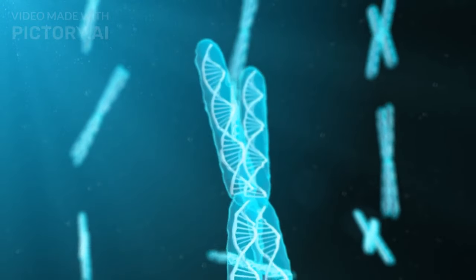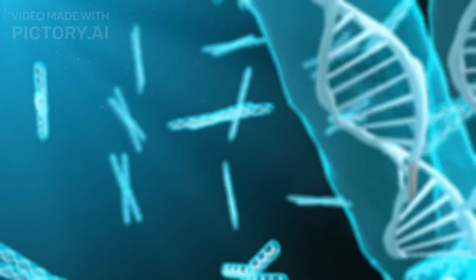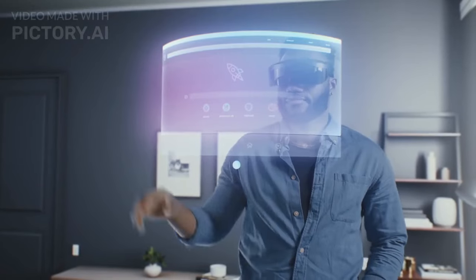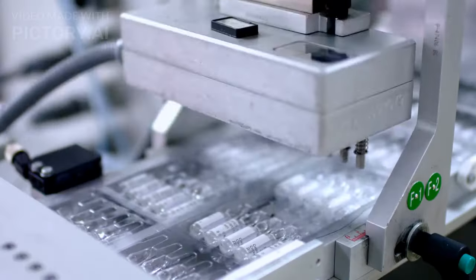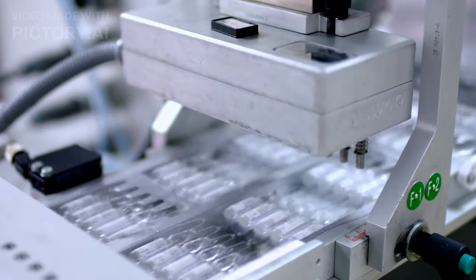Affinity chromatography. This type of chromatography separates biomolecules based on a highly specific biologic interaction, such as that between antigen and antibody, enzyme and substrate, or receptor and ligand. Each type has its own specific applications, but all share the underlying principles of liquid chromatography. The method is widely used in various industries, including pharmaceutical, biotechnology, environmental, and food and beverage.